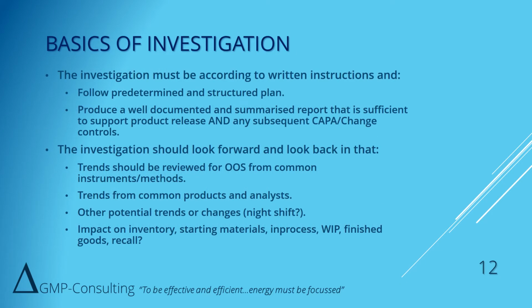Overall, the investigation should follow a predetermined and structured plan. That's what the SOP should allow for, and the finished product should be the report, which can lead to product release and any CAPA or change controls that are required. The investigation should always look forward and look back, in that if it's analyst specific or instrument specific, it may be more than one batch that's involved.